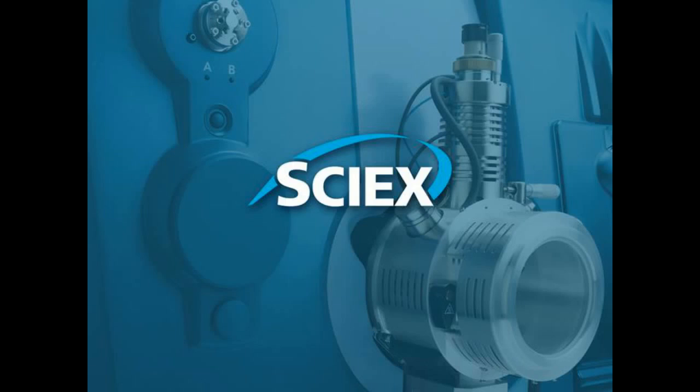Great. Our next question, can this be applied in Triple TOF 6600 system? Yes, it can. I've actually used this method on Q-trap systems, on triple quad systems, on QTOF systems, including the 6600. So yes, you can apply it on several different types of mass spectrometers. Great. Thank you for that.